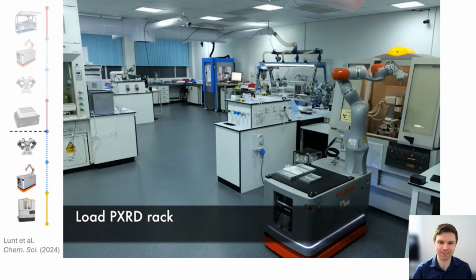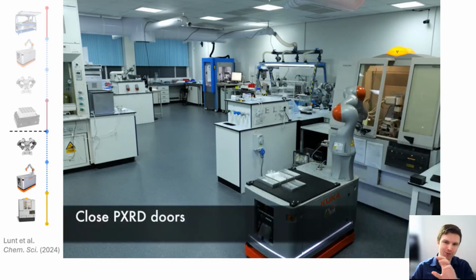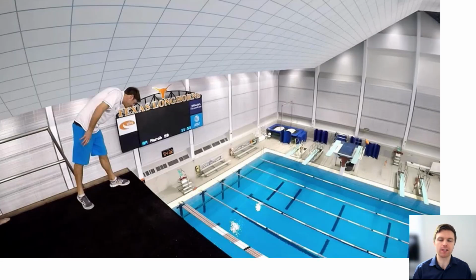Now, we must not forget that the doors are open, so we'll calibrate one more time, and we'll close one door, close the other door, at which point the characterization proceeds. Now, when people look at these kinds of self-driving labs, it can be pretty daunting, kind of like staring over the edge of a high dive.